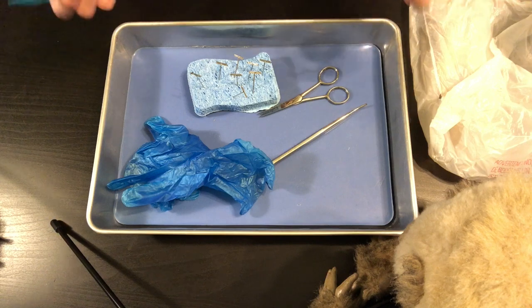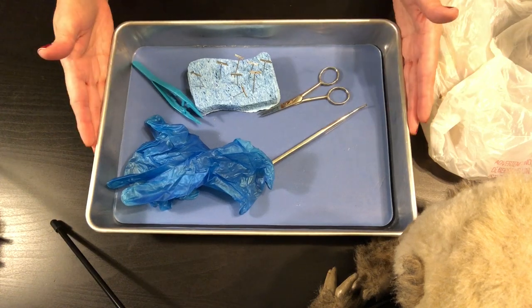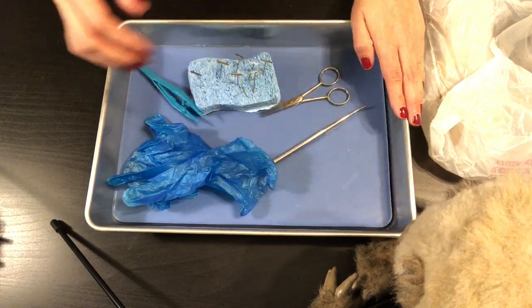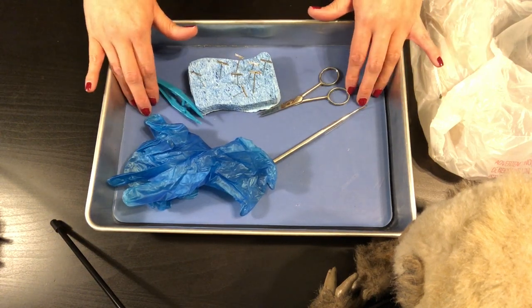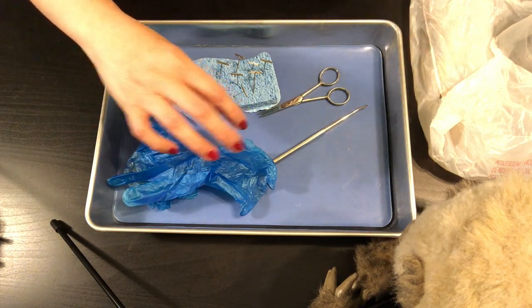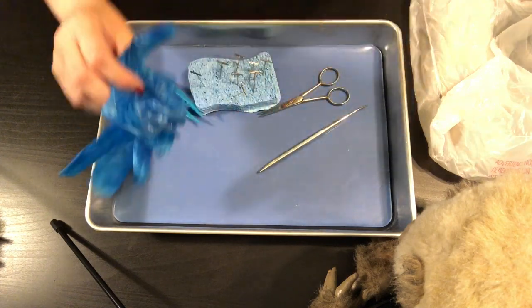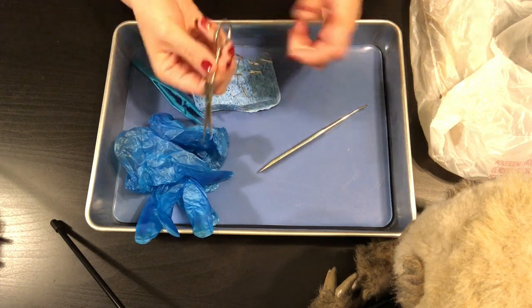Let me go over our equipment first. Right here we have our dissecting pan — it's a metal pan with a rubber latex bottom that can be removed and washed. It needs to dry completely, otherwise fungus and yucky stuff will start to grow. We also have gloves, and you'll also have an apron, goggles, and scissors.